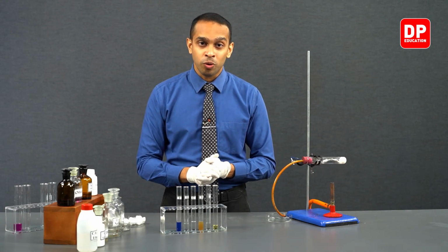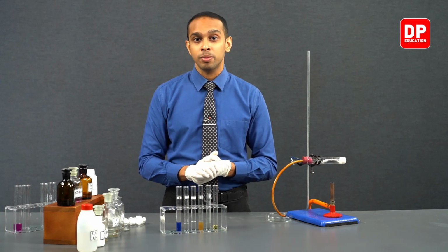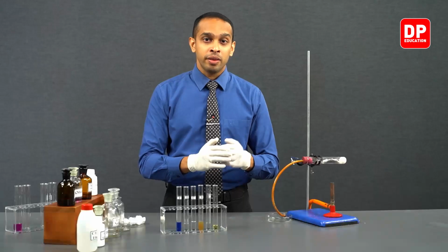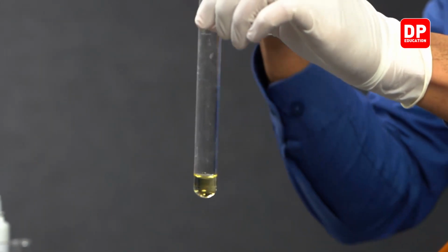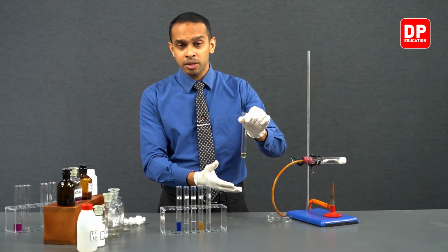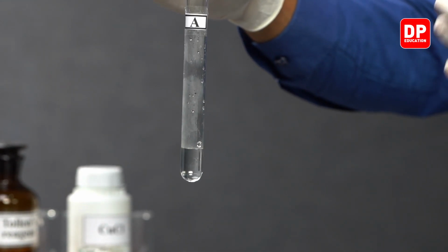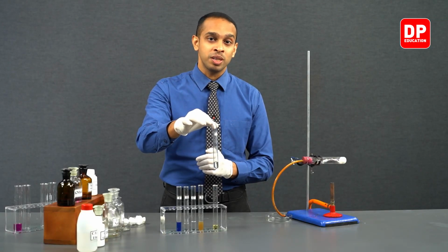So when it comes to any unsaturated hydrocarbon, if you react it with bromine water, the bromine molecules in the bromine water will get added to that unsaturated hydrocarbon across each double bond, and when this reaction is taking place, the bromine in bromine water will get used up. The color that we observe in bromine water is due to the presence of bromine molecules. As bromine gets used up, the color disappears. As you can see in test tube A, when bromine water reacted with ethene gas, the color disappeared and we have a clear solution formed.